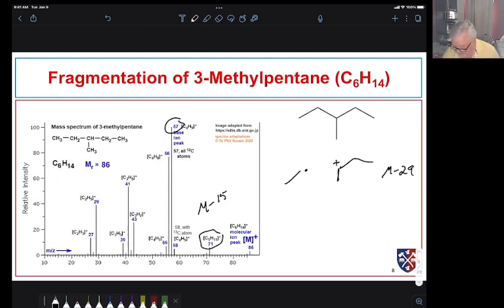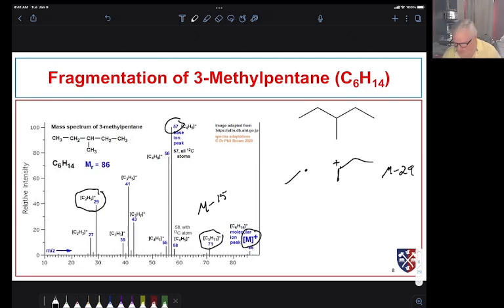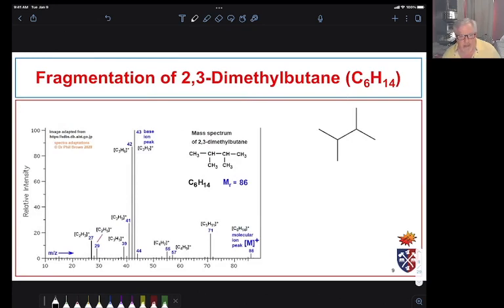We can also see the ethyl cation in the spectrum. Peaks at 41 and 43 are odd ones that are a little more involved in how they form — we'll talk about further fragmentation later. Right now I just want to get you used to looking at a molecule, breaking some bonds, and looking for the evidence you'd expect to find in a mass spectrum.